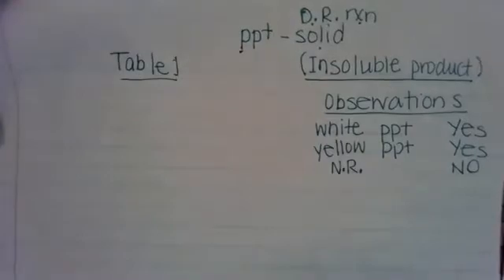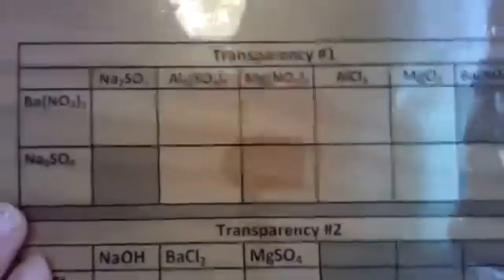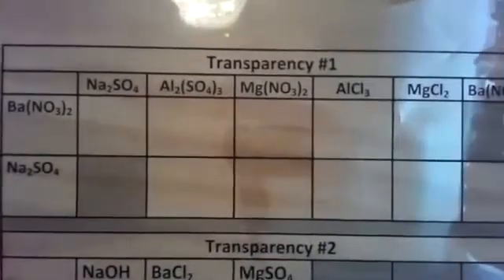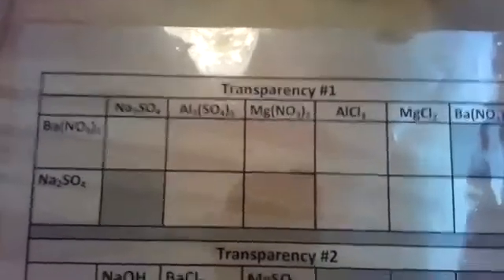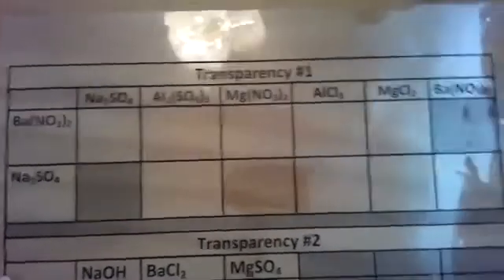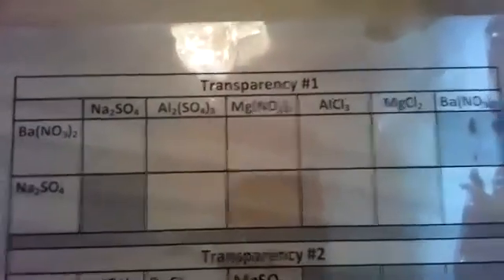So we will do most of the reactions, but we won't do all of them because there are some of them that just don't react, and so I won't have to do them all. But I do want you to get a visual of what reactions look like when they occur and they don't in a larger quantity than just the one that we saw yesterday. So yesterday's demo, you saw one of the reactions occur, and they had a yellow precipitate that formed.